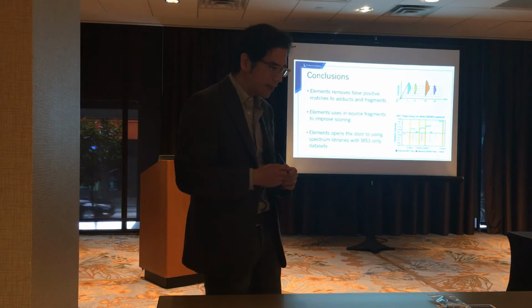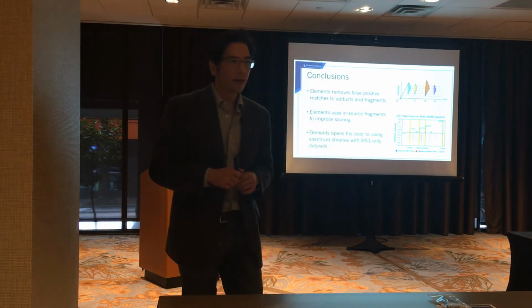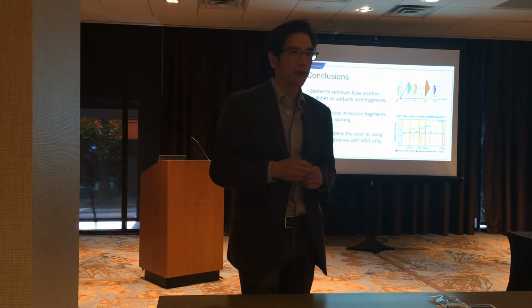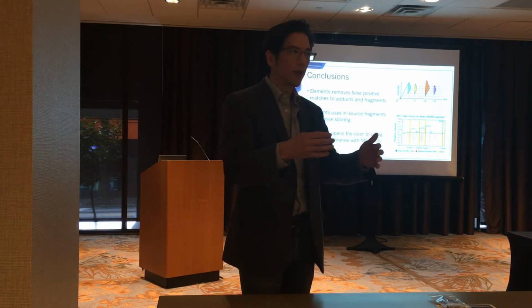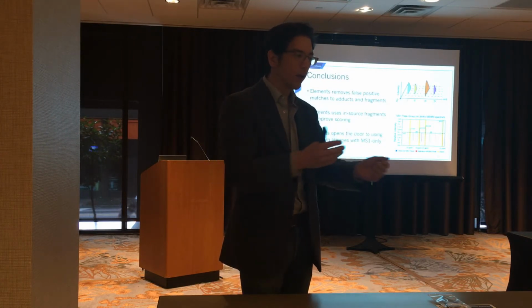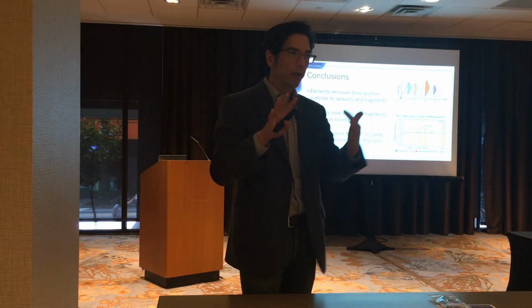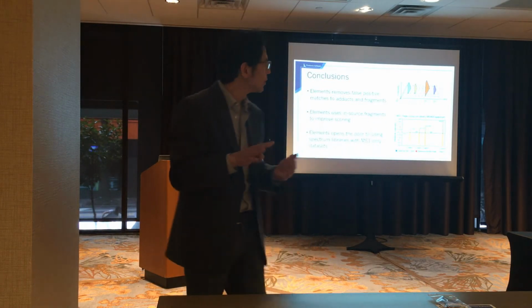So this is kind of an exciting avenue for us, actually, because not only are we seeing that, we're getting better results in some cases than if you collected MS2s, but even if you collected MS2s, we can use our additional information to augment the MS2 level data too, right? So you can use the MS2 peaks and the MS1 peak group and line those two together and say, yes, we are confident that this is the right set of ions to be looking for.